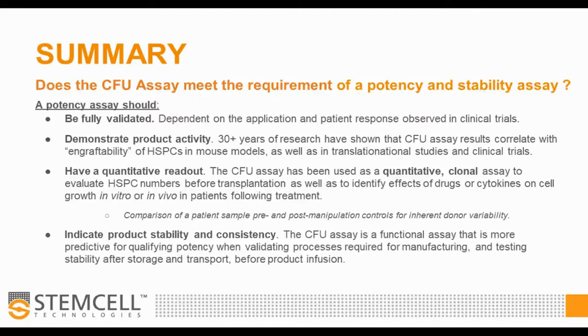the engraftment assay. The other thing a potency assay should have is a quantitative readout. The CFU assay, of course, is quantitative, it's clonal, and it does allow one to evaluate hematopoietic stem and progenitor numbers before as well as after transplantation.